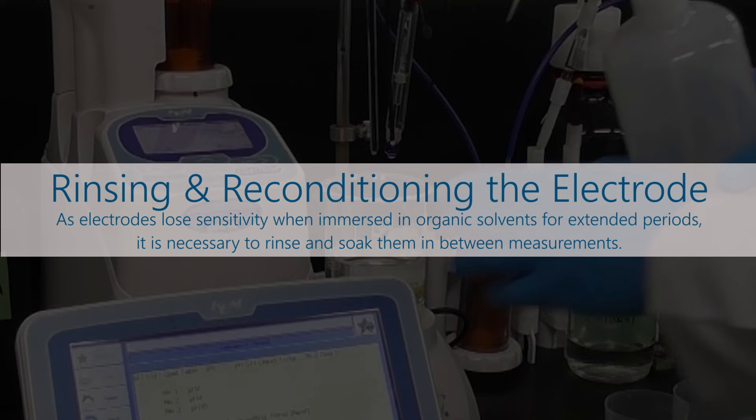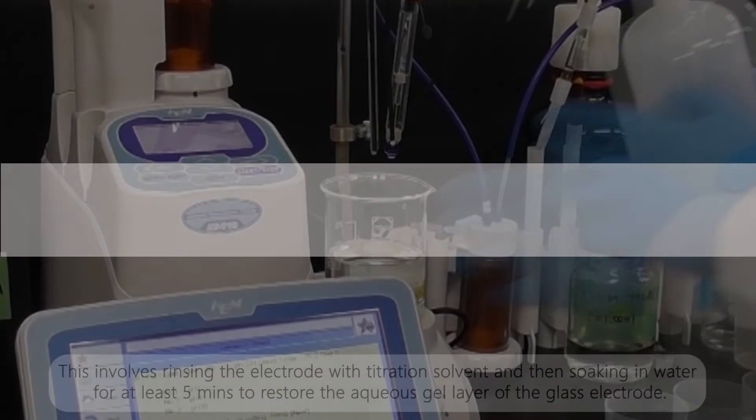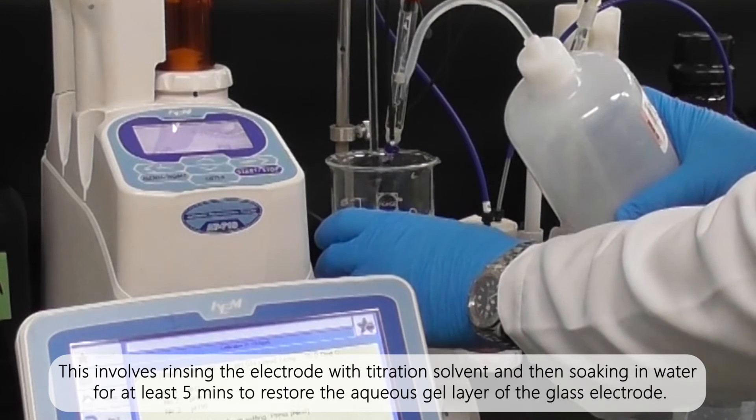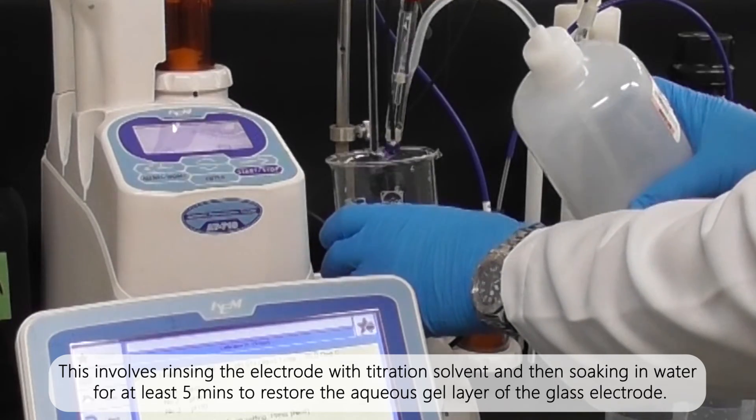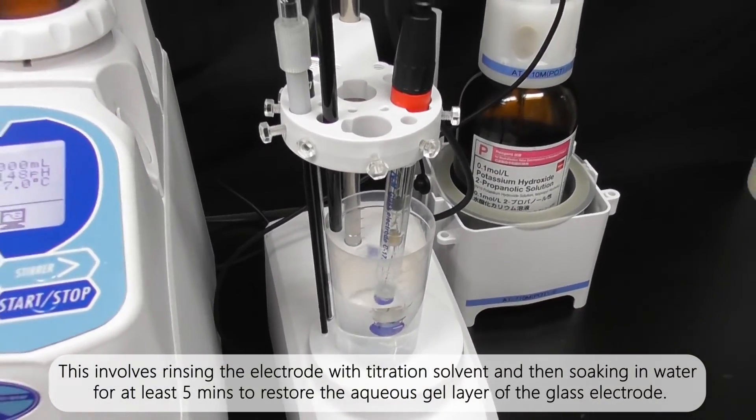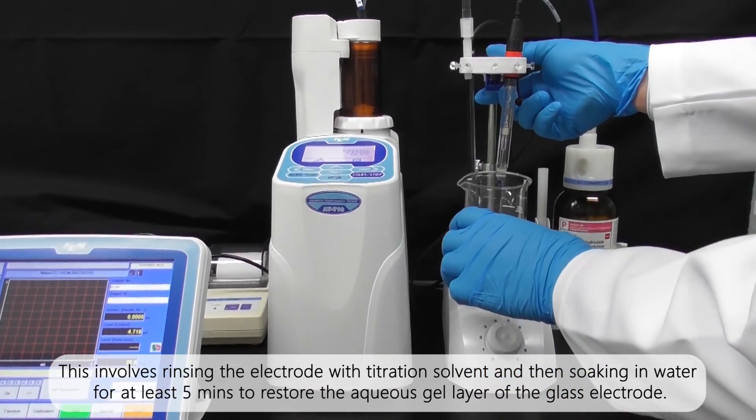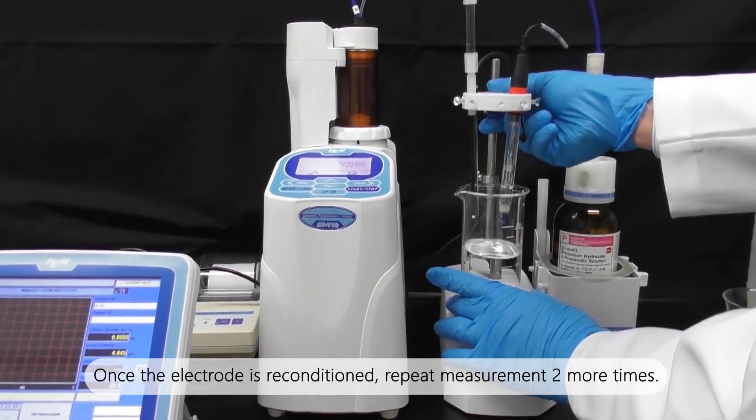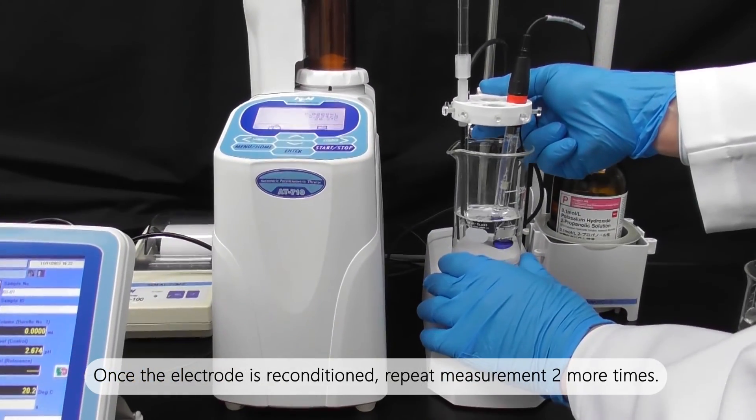Rinsing and reconditioning the electrode: As electrodes lose sensitivity when immersed in organic solvents for extended periods, it is necessary to rinse and soak them in between measurements. This involves rinsing the electrode with titration solvent and then soaking in water for at least five minutes to restore the aqueous gel layer of the glass electrode. Once the electrode is reconditioned, repeat measurement two more times.